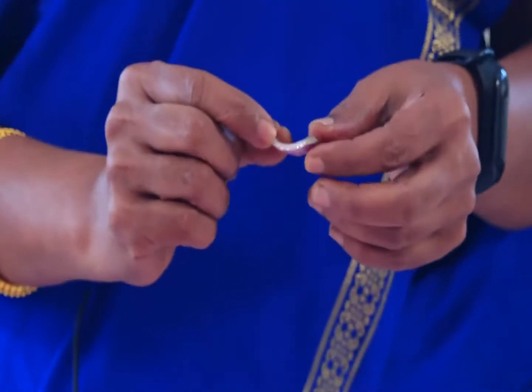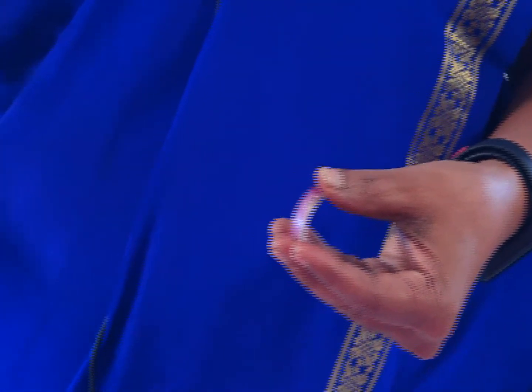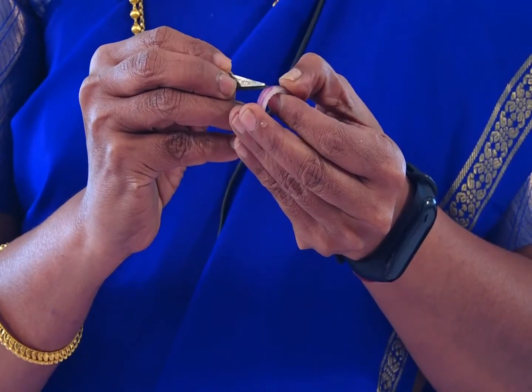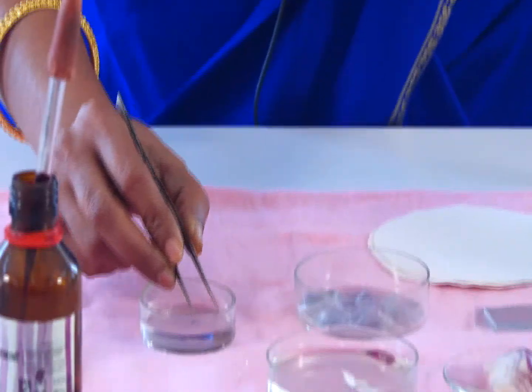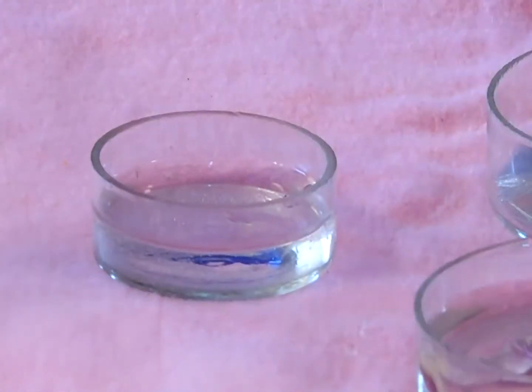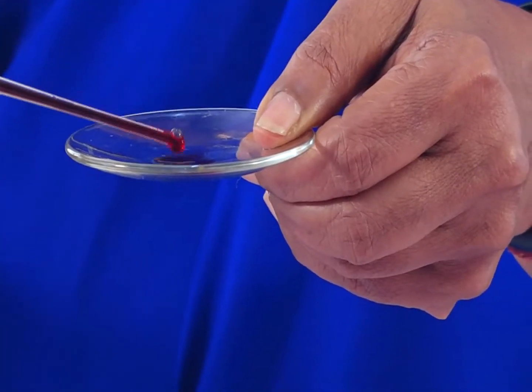Now we'll do the experiment. This is the fleshy onion scale leaf and we are going to peel the epidermis. This is the peel. Now blot the water, remove the excess, and pour on the glass. With the help of a dropper, add Acetocarmine stain — 1 or 2 drops.